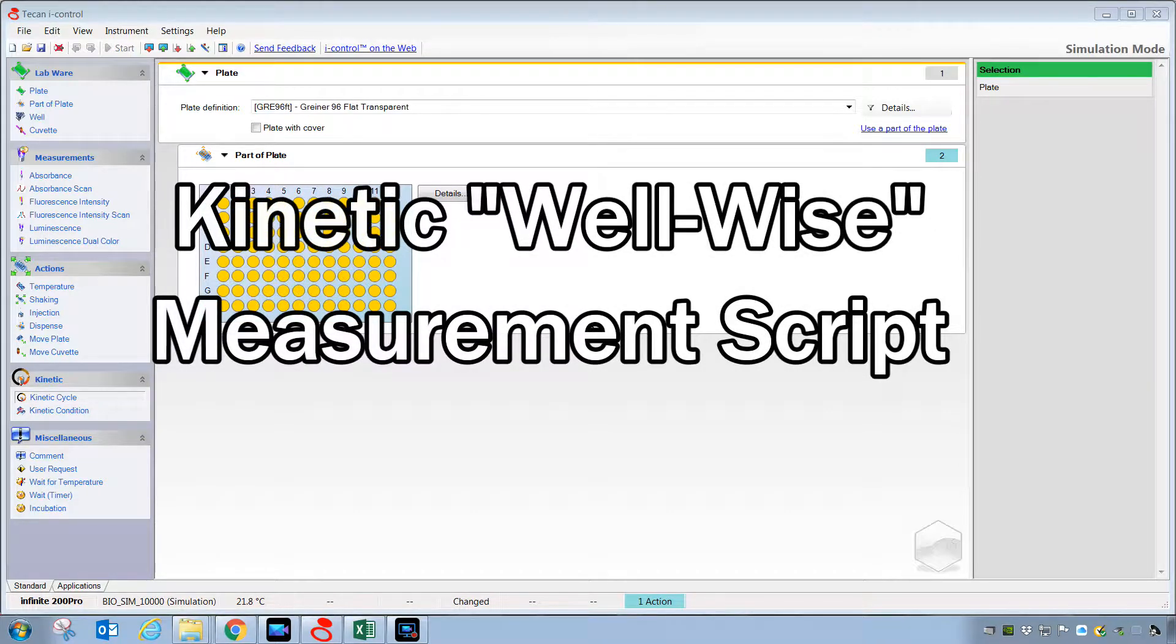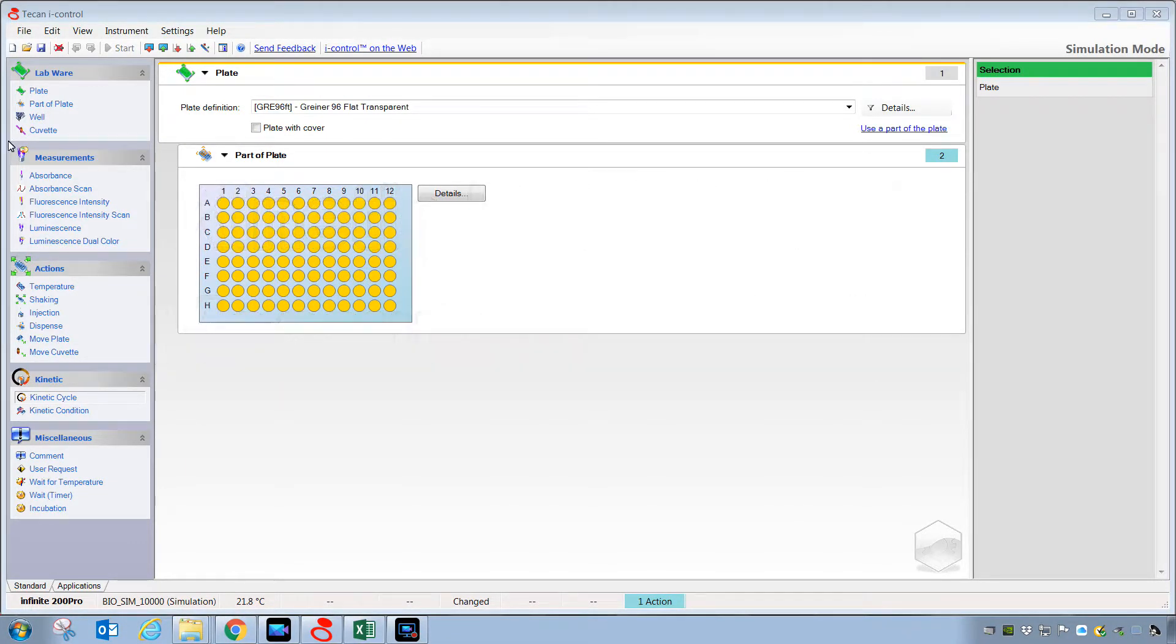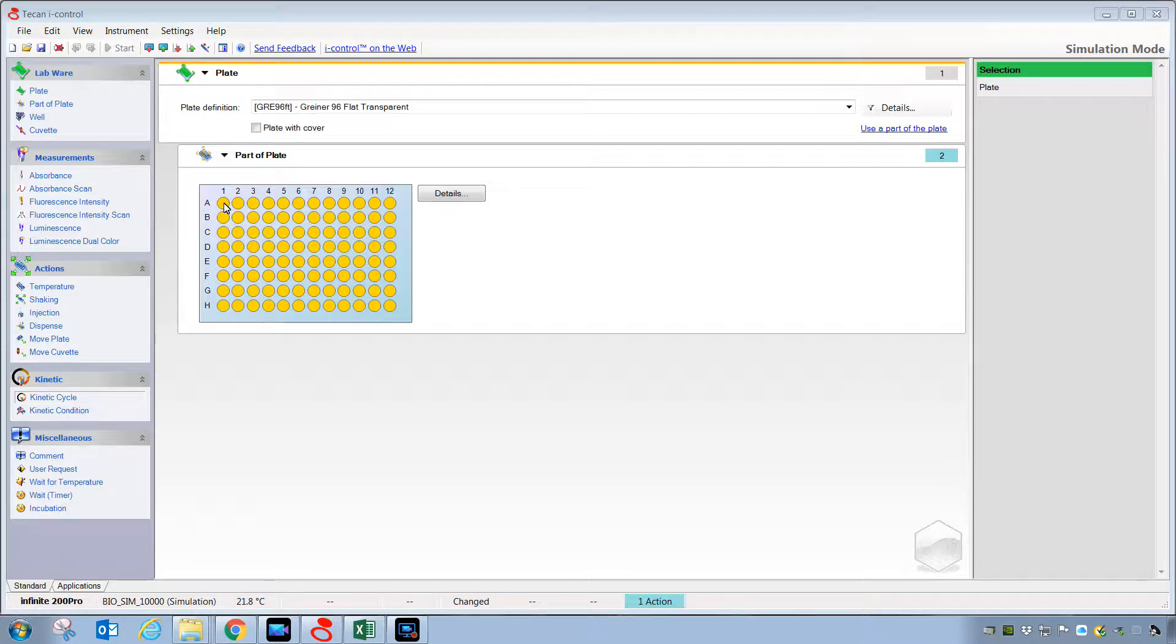In this example, we'll be covering the use of what's called well-wise kinetics. That is a process where the kinetic on one well is measured and completed before the reader moves on to collect kinetics from subsequent wells.